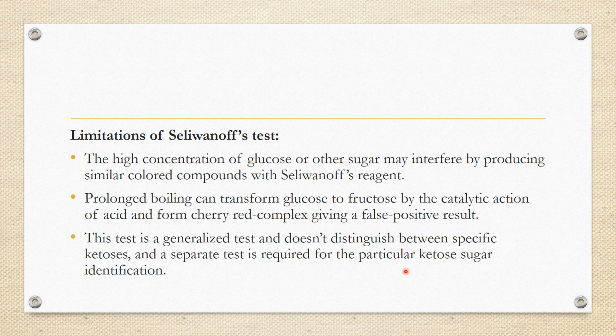If you need to identify a particular ketose sugar, you need a separate test to identify it. But the Seliwanoff's test is a generalized test, just to identify whether ketose is absent or present in the given sample.